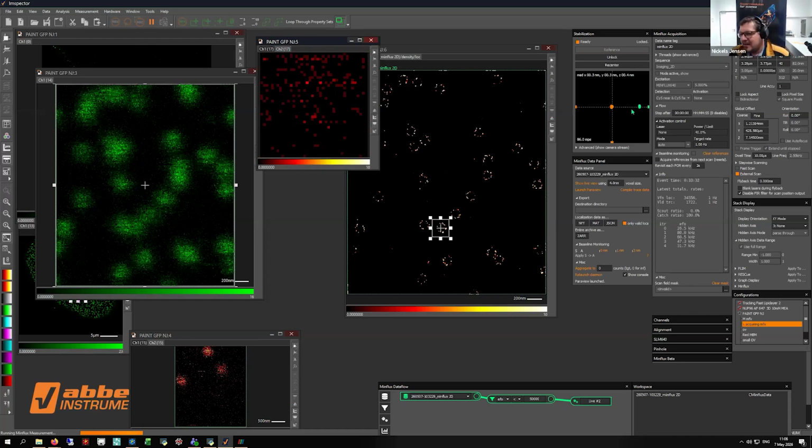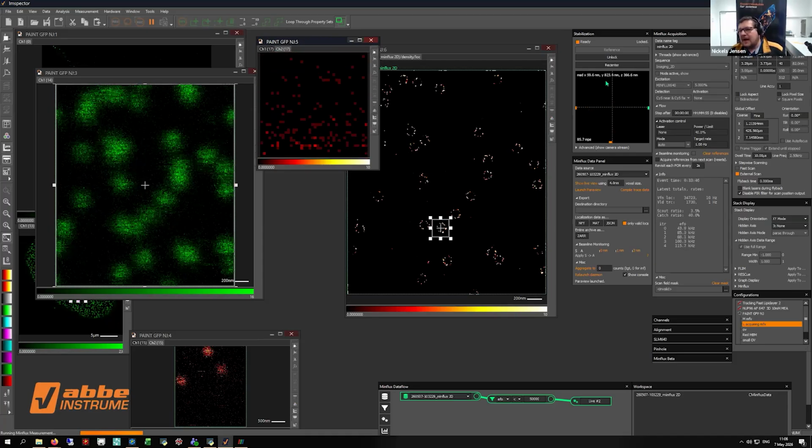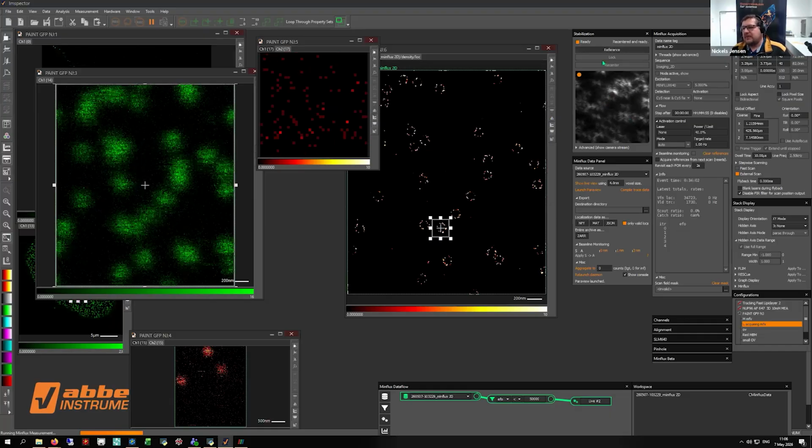And as you can see here, in orange, we see the stabilization XY, this dot, and in green, you see this in Z. And if I would now start bumping on the table here, I kicked this, I'm sorry, I bumped too hard on the microscope and now I lost the stabilization. Sorry. We can directly change this. I start the stabilization again. You see the gold beads. I take a reference.